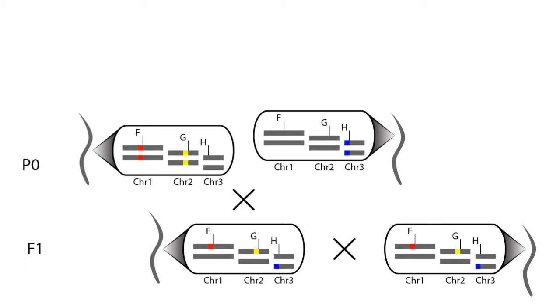As part of class, we'll cross two worm lineages, or populations, and then mate their F1s to produce an F2 generation. Then, if there are incompatibilities between the parental lineages, we'll expect some genotypes to be missing in the F2 generation.